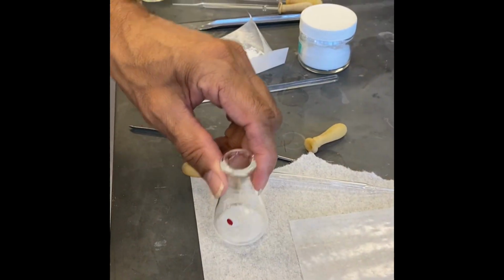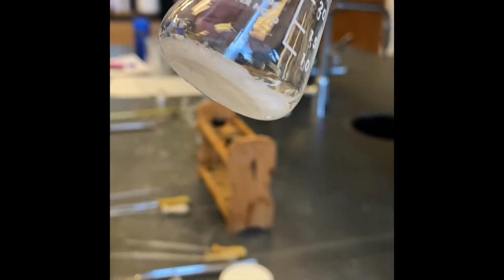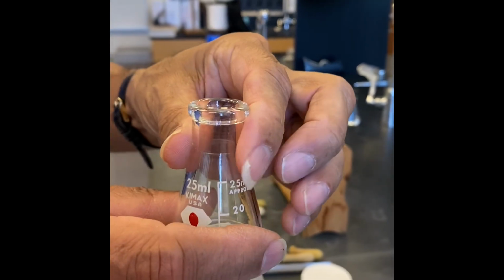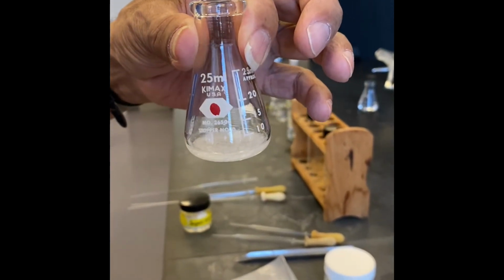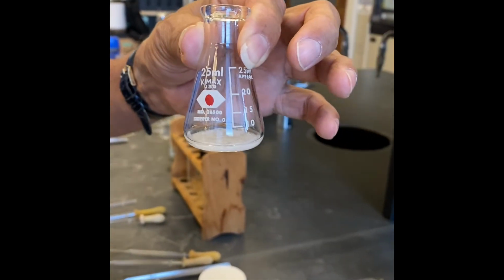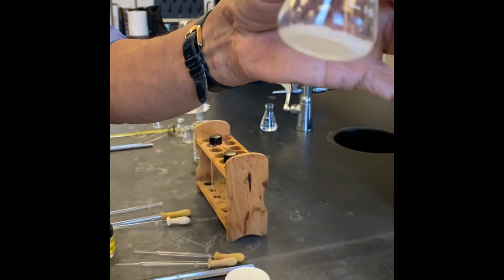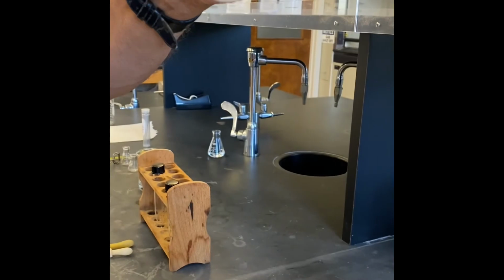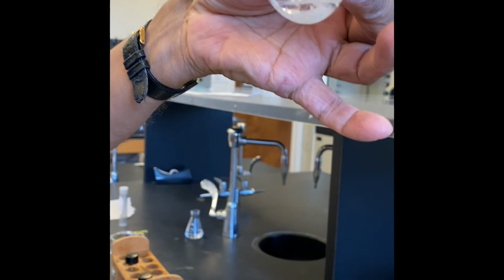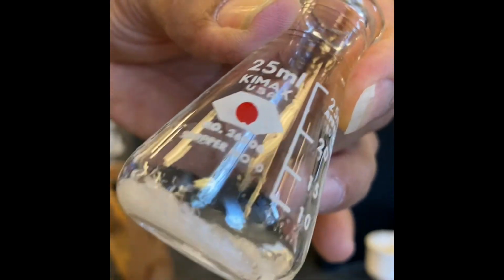Okay, so the crystallization is complete now, right? So you can see the crystals settling down, everything. So it's ready for filtration. It's already room temperature. Now, if you want more compound to be recovered, you can cool it in cold water. Okay, that is one option. But you don't want to because it's a good recovery here. So before you filter it, you dislodge all the crystals with the spatula. See now, you can see all the beautiful crystals actually. Can you see that? I hope it's coming out well.